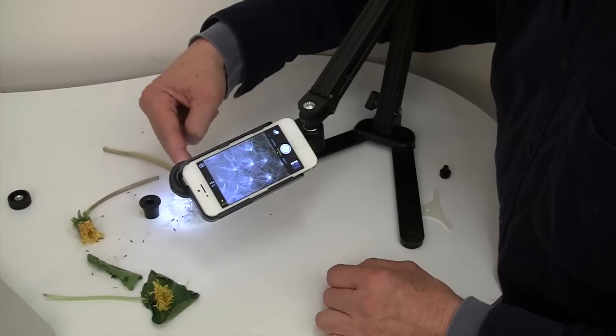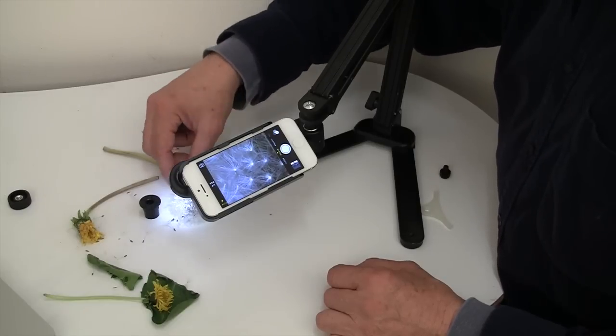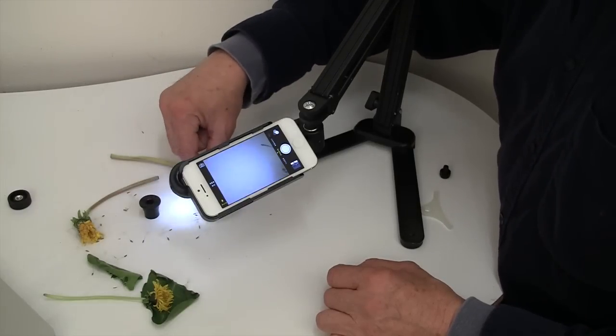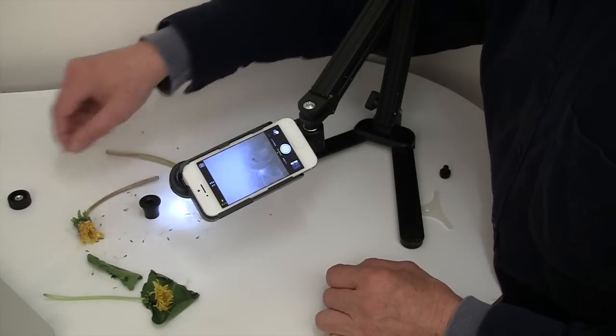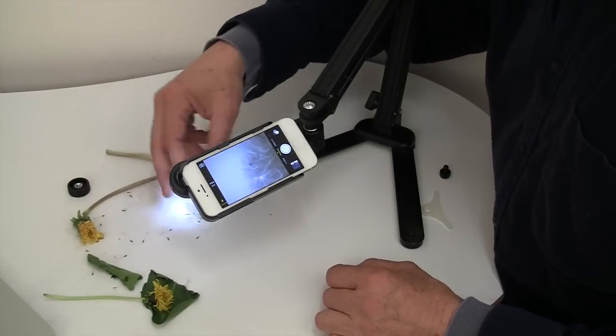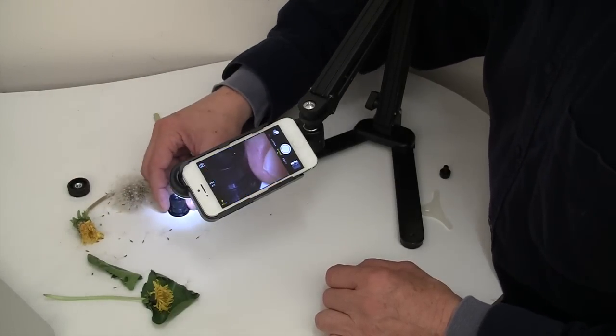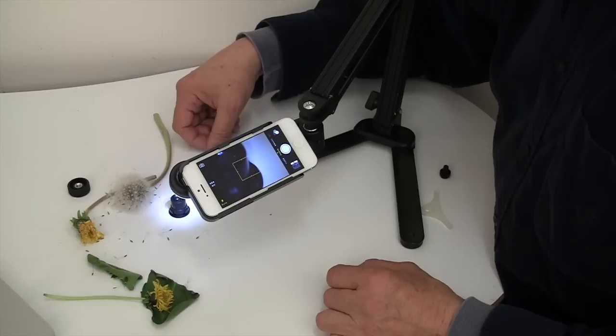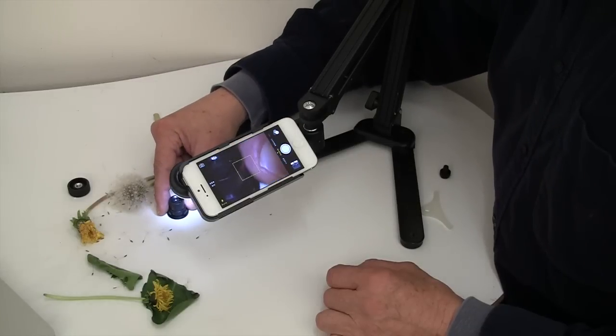Well, this is nice. Now I have a distance view to work with. I'm not having to touch the dandelion. I can move things in and out. In fact, if I'm working on small parts assembly and manufacturing quality control, I have to do is just put the part in there to inspect it with those adjustable LEDs.